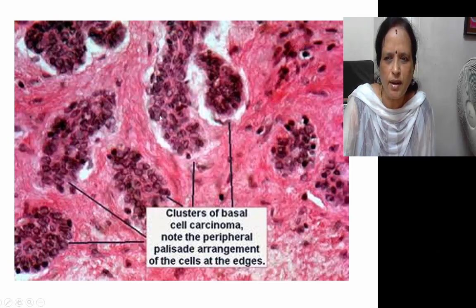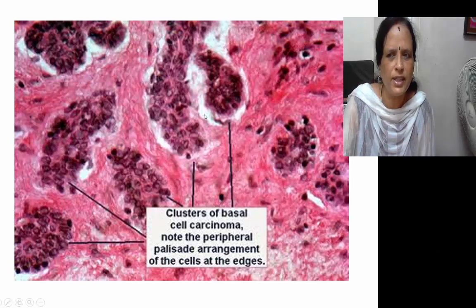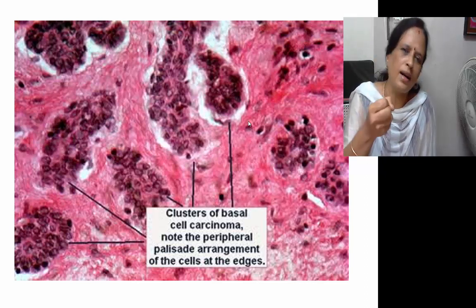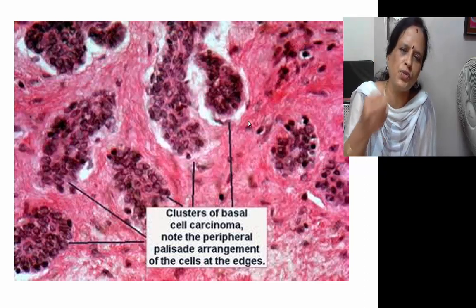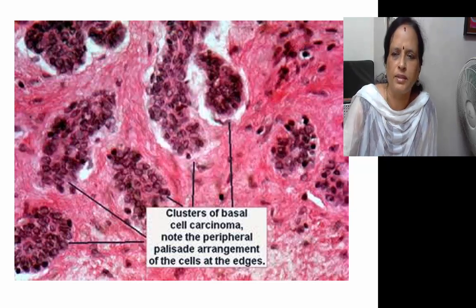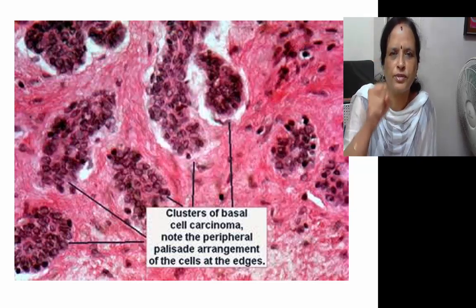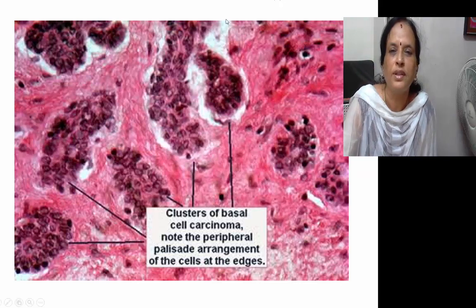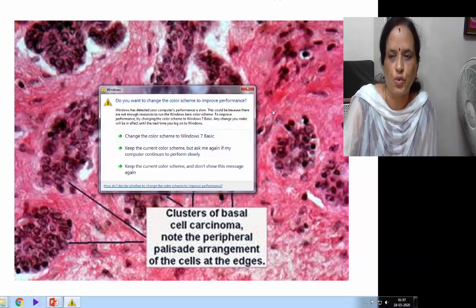What do you see around the nest? A whitish, clear area — that is a retraction of the stroma. It is an artifact of these tissues which are fixed in formalin — a retraction of the dermal stroma.